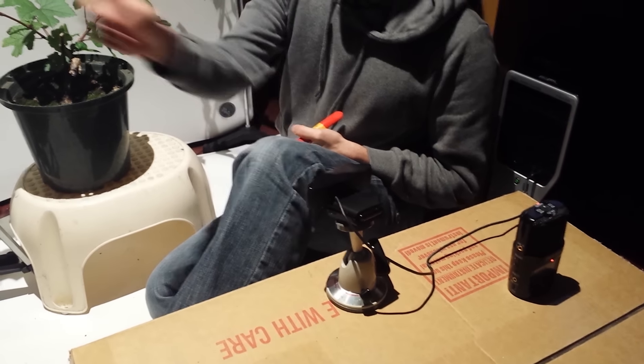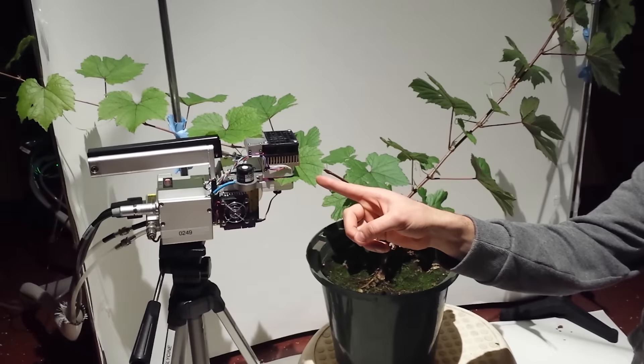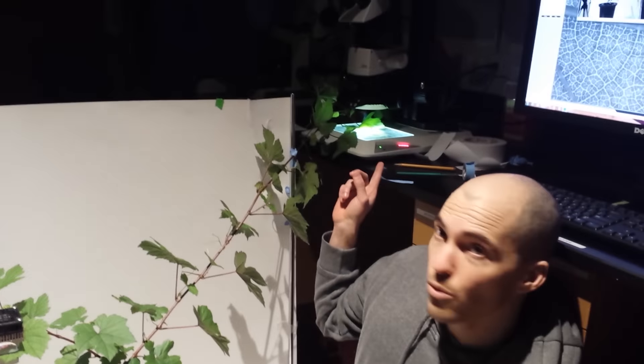We have here a webcam to observe the wilting of the leaves, a commercial gas exchange system will measure stomata conductance, and using a microscope we will observe the embolism spread throughout the leaf.